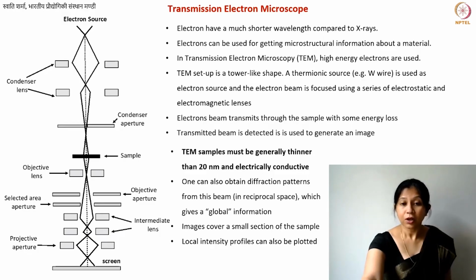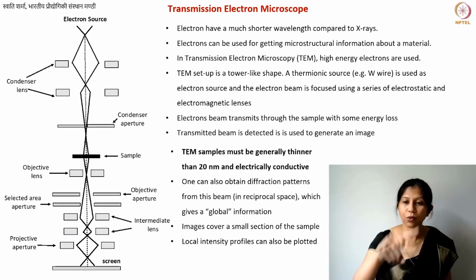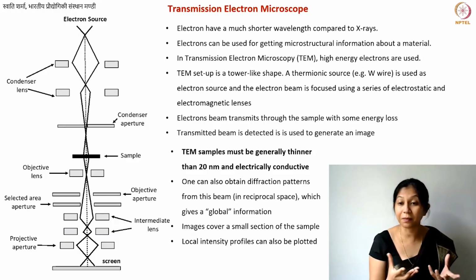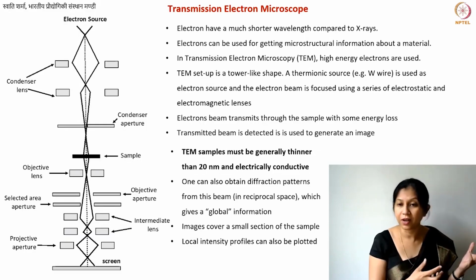Okay. So yes, one more thing is that you can plot the local intensity profile. I'm mentioning this because this is also very commonly seen in a lot of publications. You will see what is called an intensity profile. I'll show it to you in the next slide. So intensity profiles are basically just something done by the software. Even if you just take a TEM image, you can do this processing by yourself using practically any image processing software.